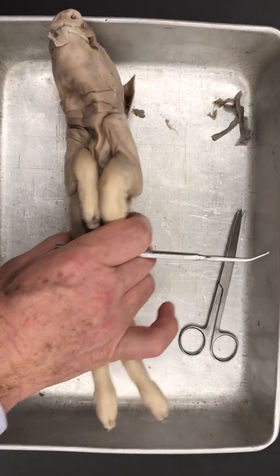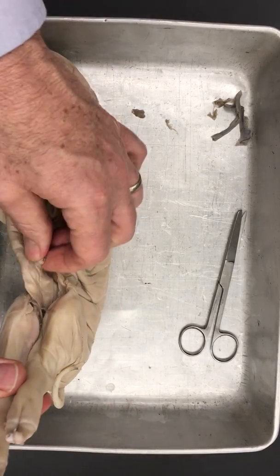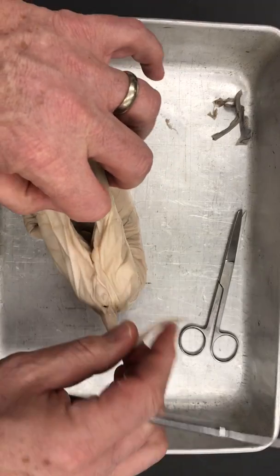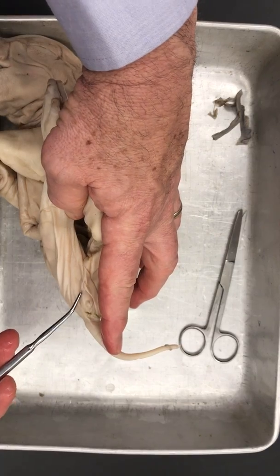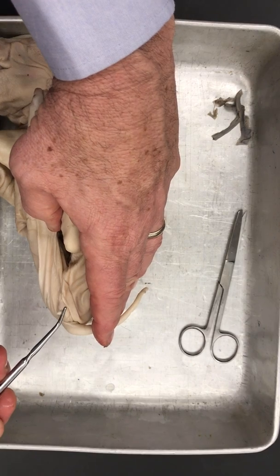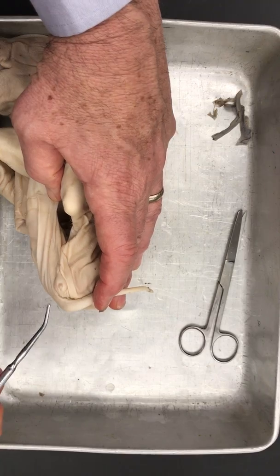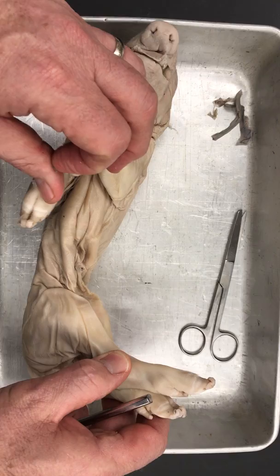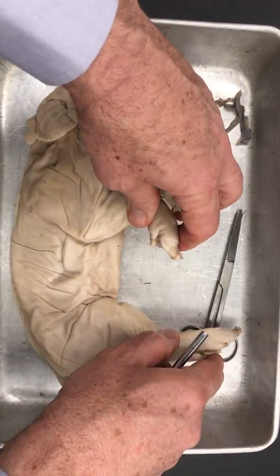Let's look at a female pig. So this is someone's female pig. Their umbilical cord has been cut, not really all that great either. But let's look at how you can tell. So, ventral to the tail, the pig has this, called the urogenital papillae, this little bump, this little thing that sticks out. And there's the urogenital opening for the female. So this is a female pig. It has mammary papillae, just like the male does. So a quick tour of the external anatomy.